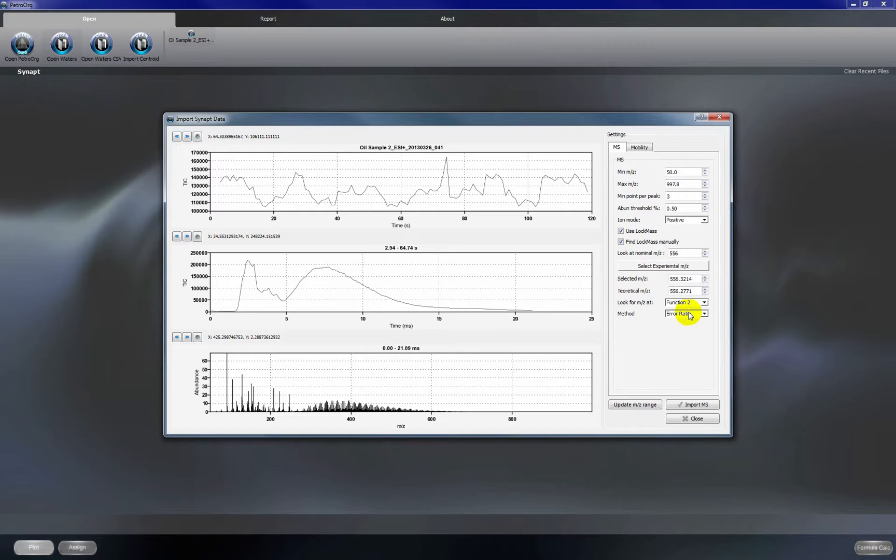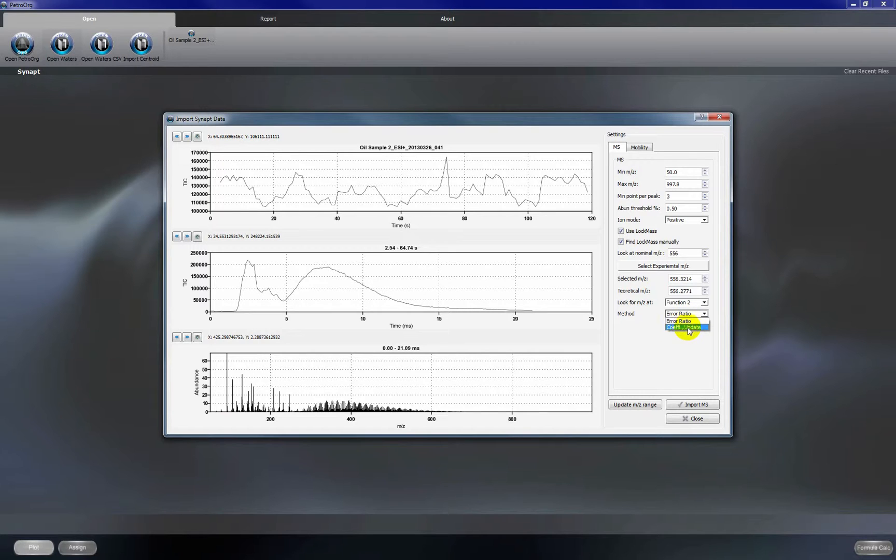We're going to use function 2 to look at our M over Z values and we're going to use the error ratio method. So there are two methods. The error ratio method should be used if your mass spectral peaks overlap with your calibration, your lock mass peak. If your mass spectral peaks of interest do not overlap with your lock mass peak then you would use coefficient update.